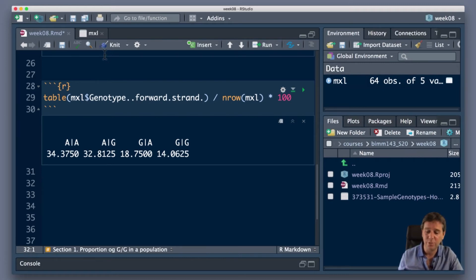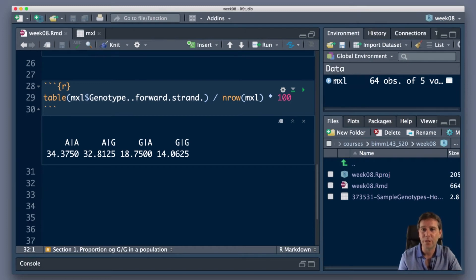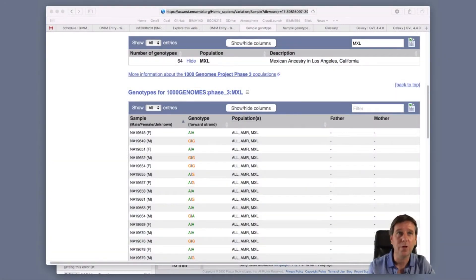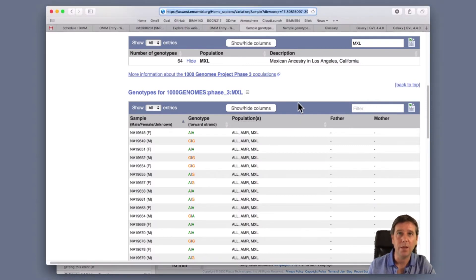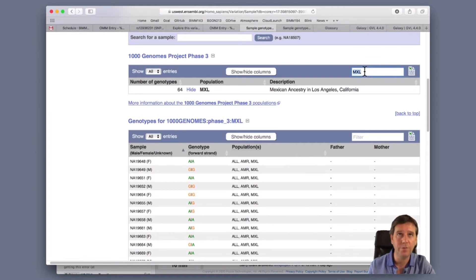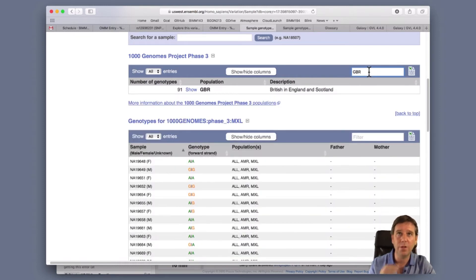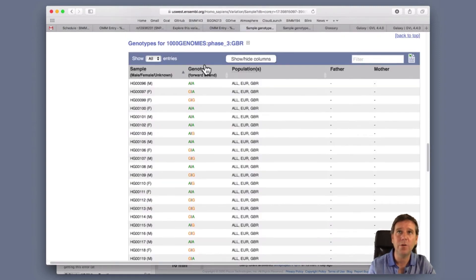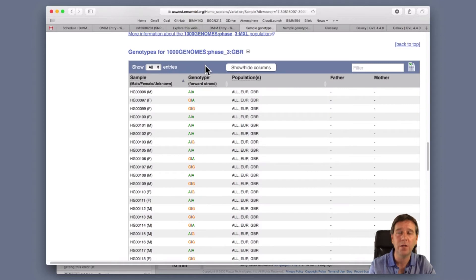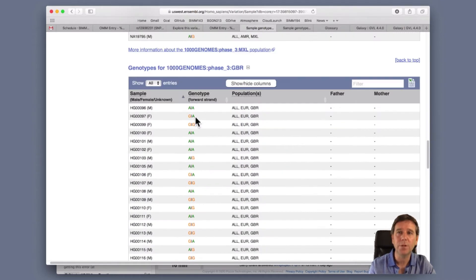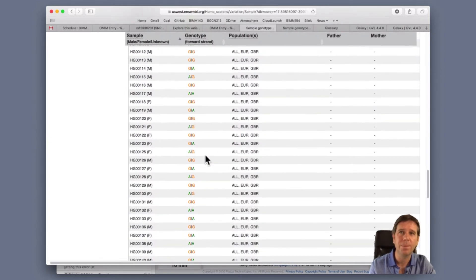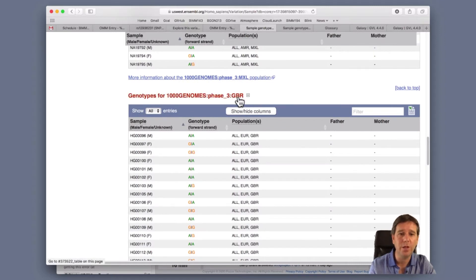Let me save this script and go back to Ensembl to get the GBR population data. Here we are back on the website - I can take the MXL filter off. Let's do British in England and Scotland - the GBR population. I'll focus on that - GBR - push return. It says there are 91 folks in it. I'm going to download the whole table, which goes to my downloads folder. I'm going to drag the new CSV file into my project directory - it's got a slightly different name with 2.2 rather than 3.1.